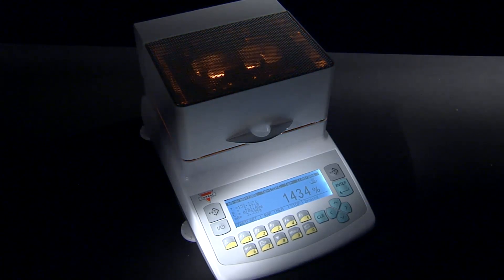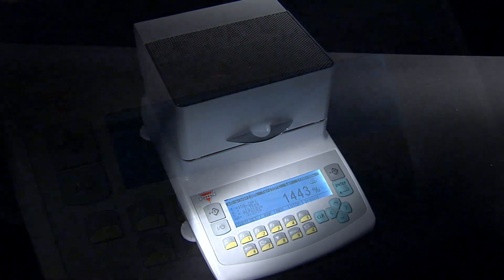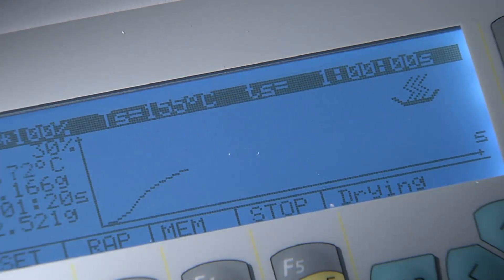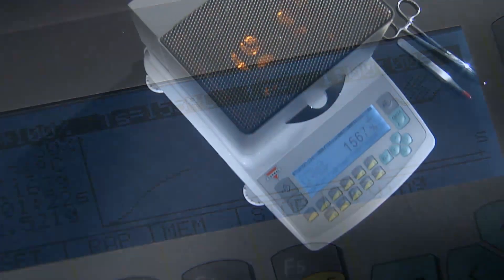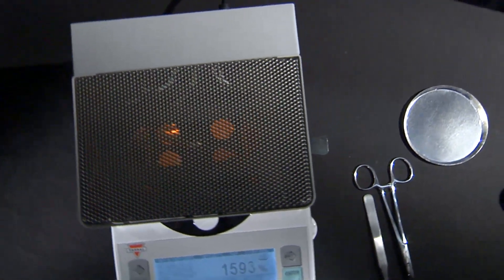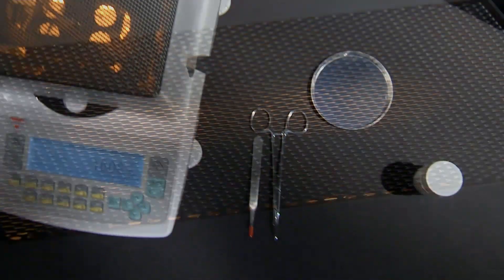The analyzer is equipped with a graph plotting function that is used to plot results in real-time as data is gathered. The AGS also features multiple analysis modes that allow performing moisture analysis based on user-defined parameters or automatically.